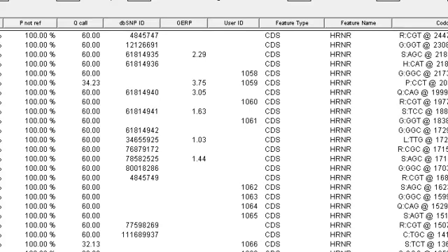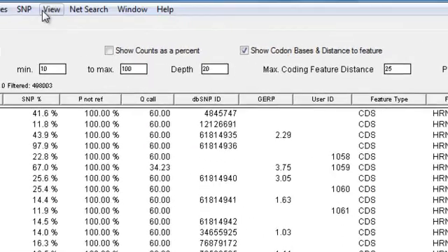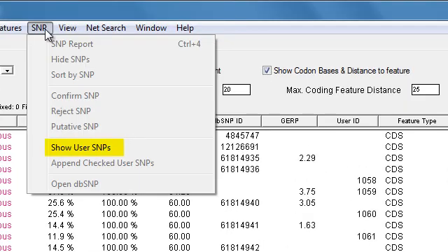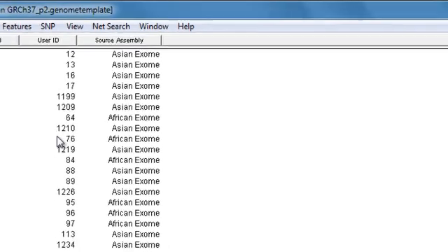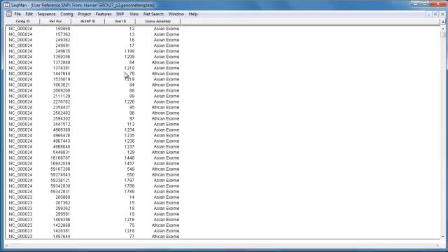I can see a complete list of the user SNPs by going to SNP show user SNPs. And this report shows all the user annotated SNPs in my project and the source assembly where they were annotated.